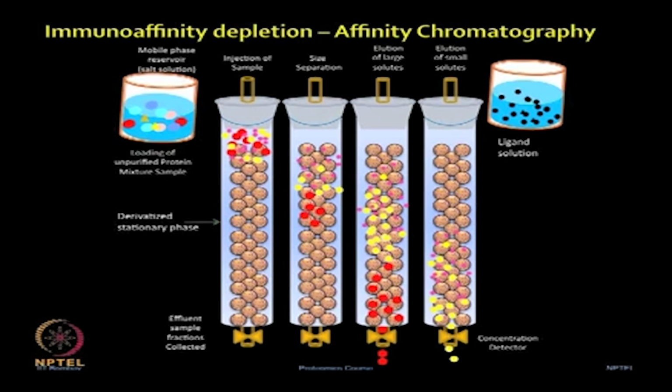To eliminate those highly abundant proteins, the authors used the multiple affinity removal system from Agilent Technologies, and they removed the most abundant proteins from the serum sample, including albumin, IgG, antitrypsin, IgA, transferrin and haptoglobin. After the abundant proteins were depleted, the authors moved on to protein extraction and further analysis.